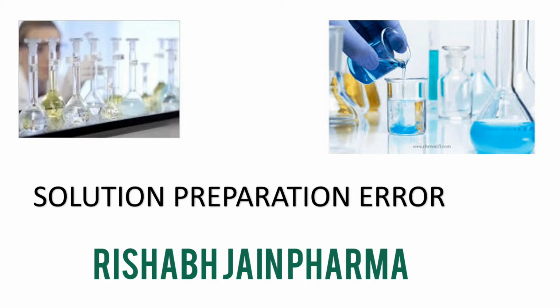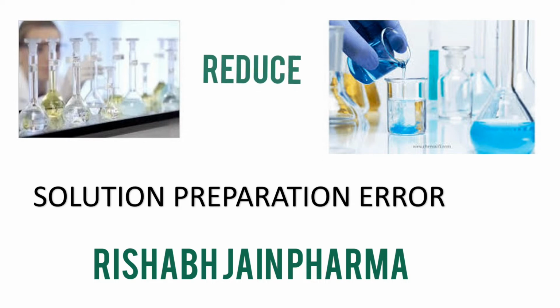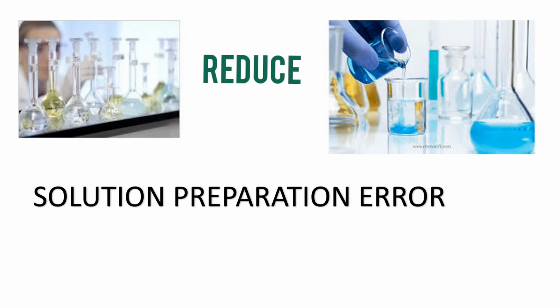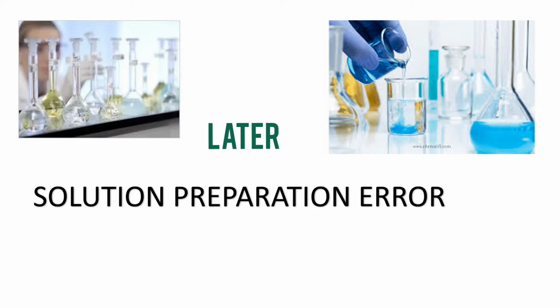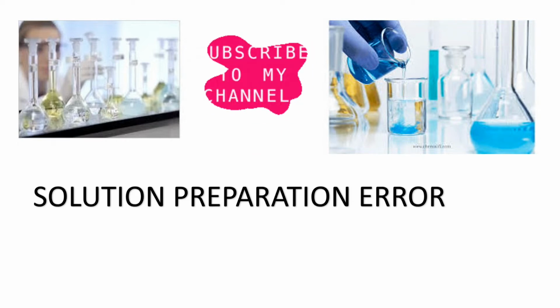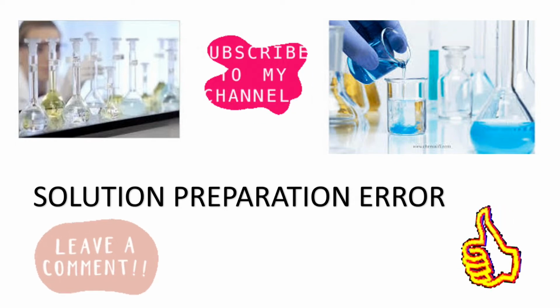If you evaluate all the errors in the laboratory, that includes solution error, transcription error and other errors. If you identify, the number of errors in solution preparation is very high. How to reduce this? Because currently, if you see, there are so many warning letters related to human error. So how to reduce the solution preparation error? In today's video we'll discuss this topic. Let's begin.